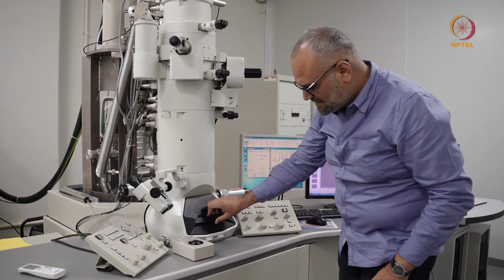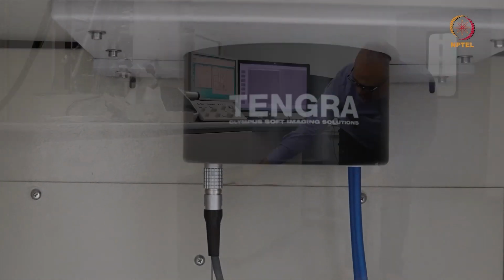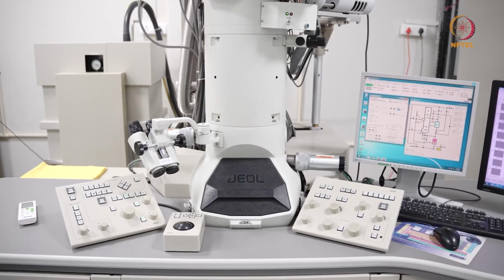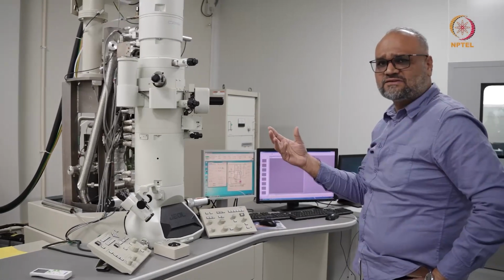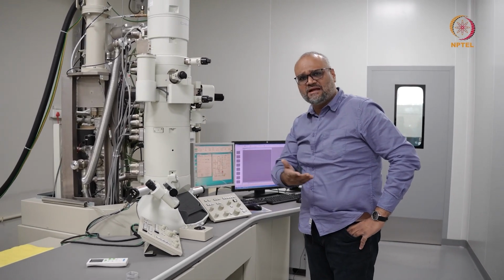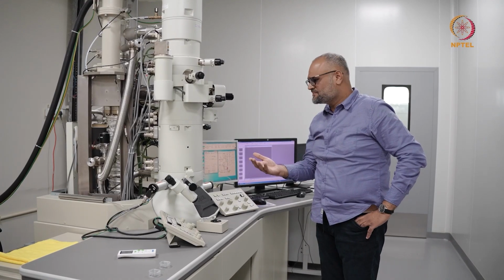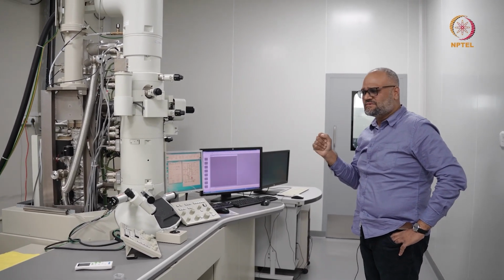And if you go further down, there's a camera below. On this microscope, we have a CCD camera on which you record the digital images. In the old school microscopes, you actually had photographic plates, and you were exposing the electron beam and opening a shutter and recording the images on a photographic plate. So this is the general layout of a transmission electron microscope.